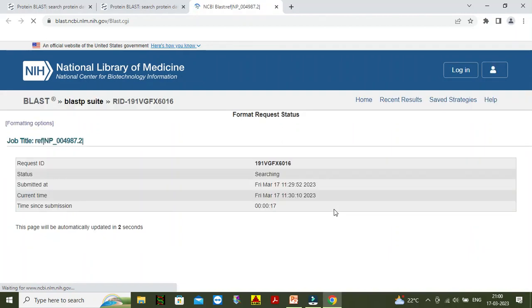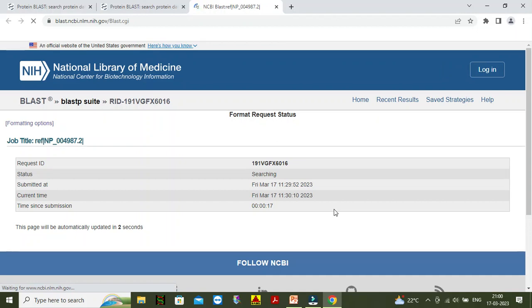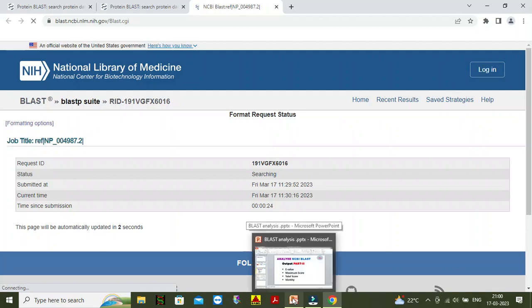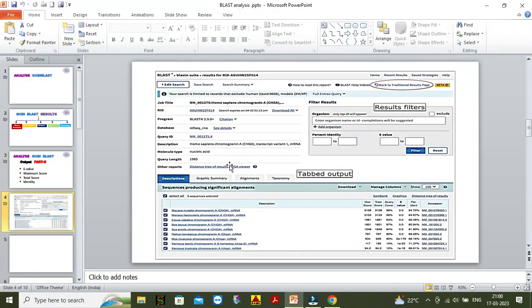BLAST output can be read in different sections, which we will discuss. The result will come like this. This is the summary part, where the information of your query is available — like the name of your protein or nucleic acid, what is the ID, query ID, what is the molecular type, whether it is nucleic acid or protein, and query length. Everything about your query is available in this section.